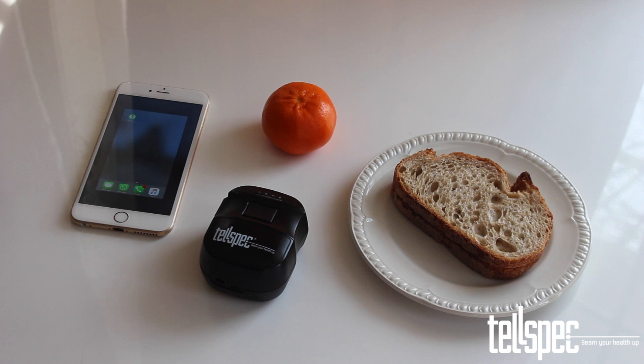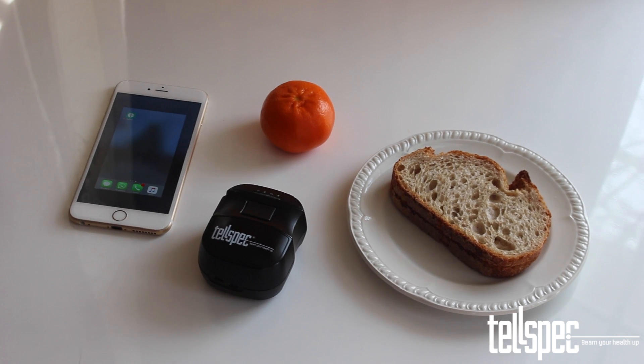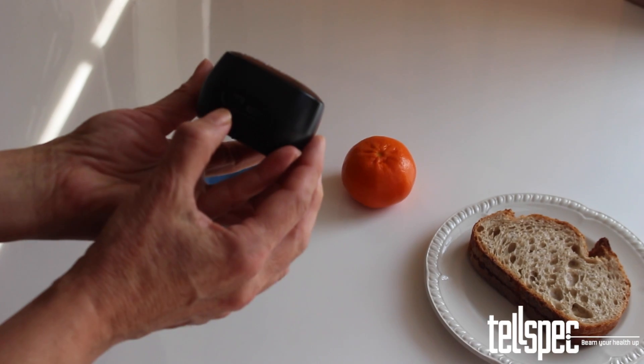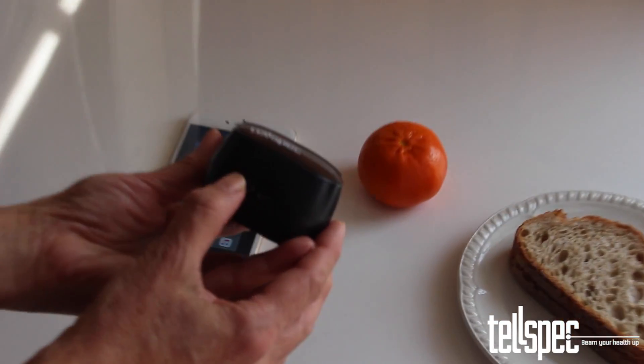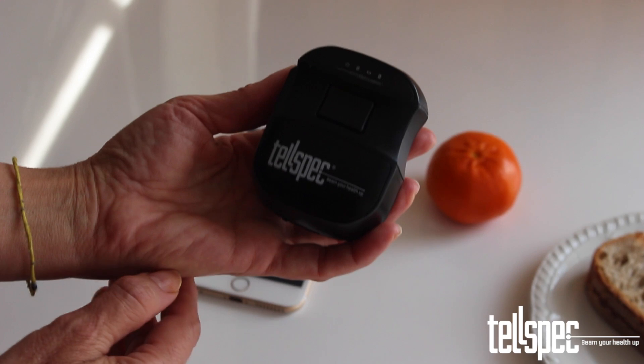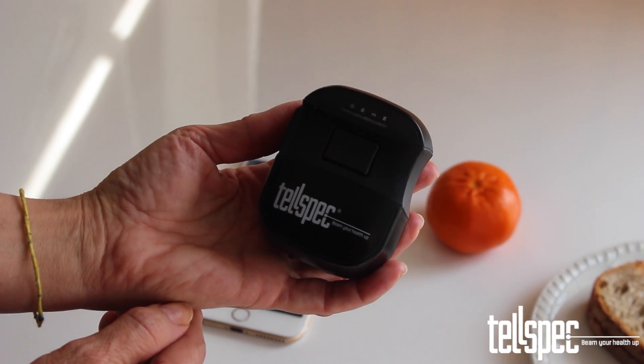This is a brief explanation of how the Telespec food scanner and app works. To turn on your Telespec scanner, locate the power switch at the rear of the device and slide the switch to the on position. You will notice the power light illuminated on the top of the device.